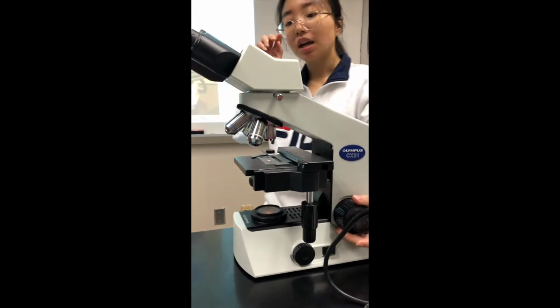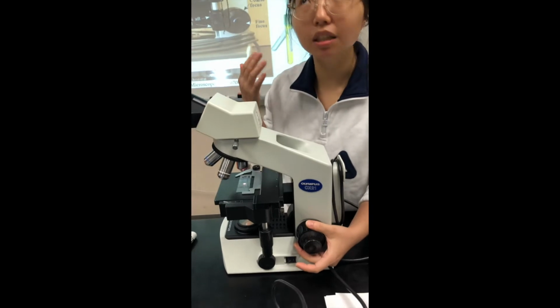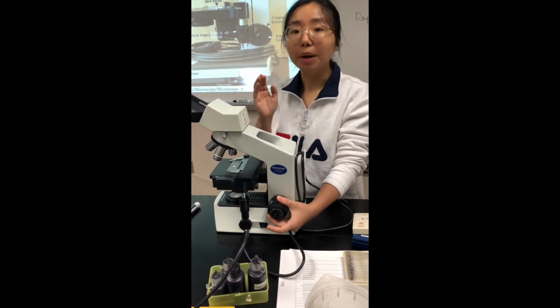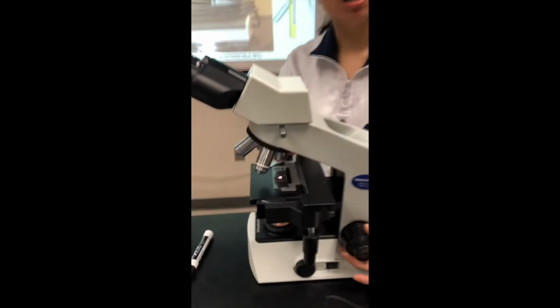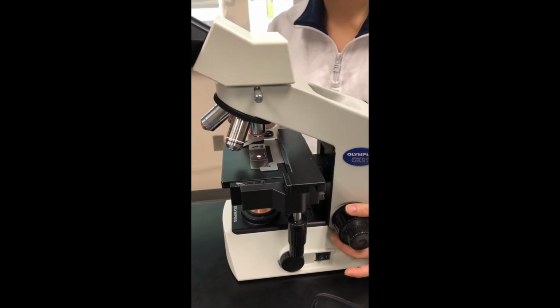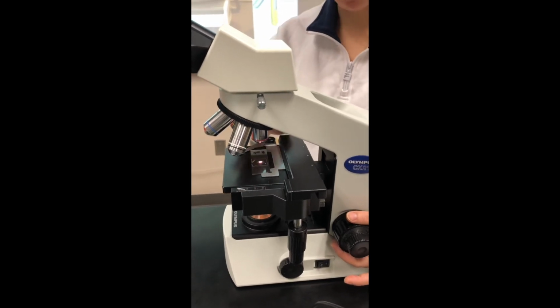One thing I want to emphasize is that when you use the coarse focus to adjust the distance between your sample and the objective lens, the thing you need to pay attention to is that you are only allowed to adjust using the coarse focus when you have the 4 times, the shortest objective lens, in position, in this position.